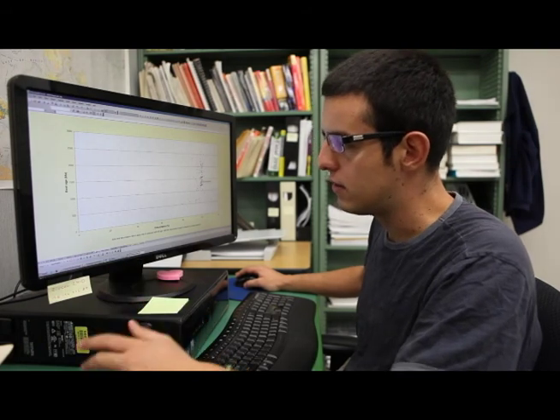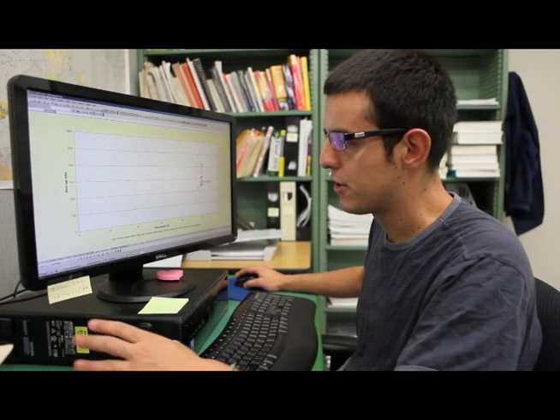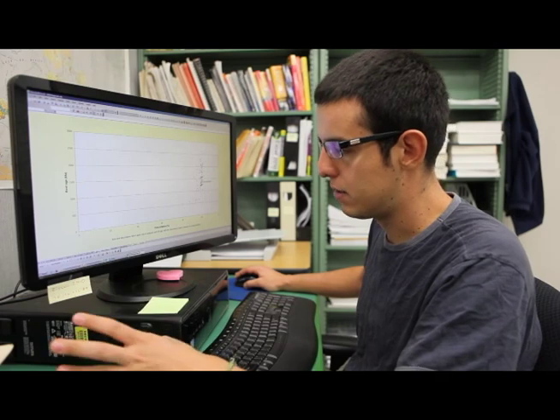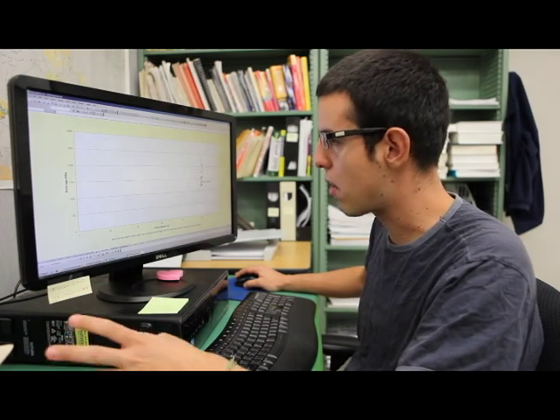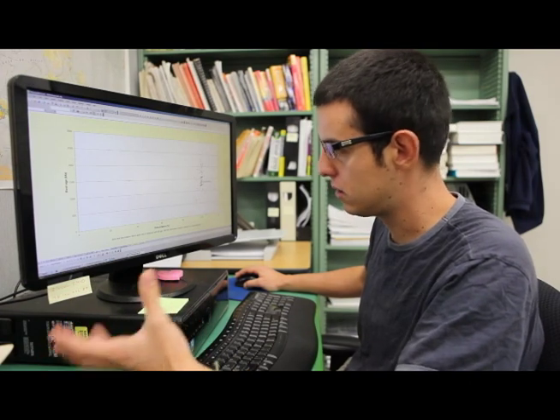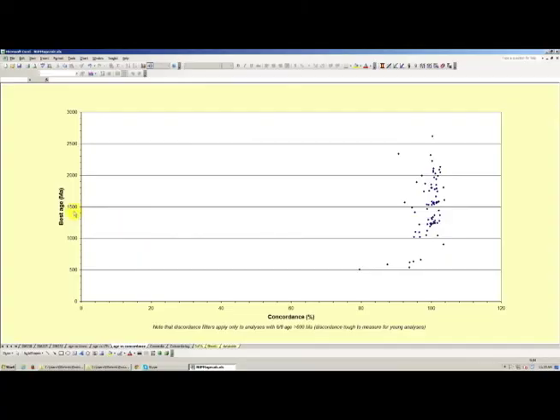If there is a modern lead loss event, your 6-7 age is not going to be affected significantly. But if lead loss is not modern but occurred at some time in the geological past, say some of these grains that are 1500 Ma old suffered a metamorphic event that generated lead loss at 500 million years ago, then that is going to modify your 6-7 ratios.